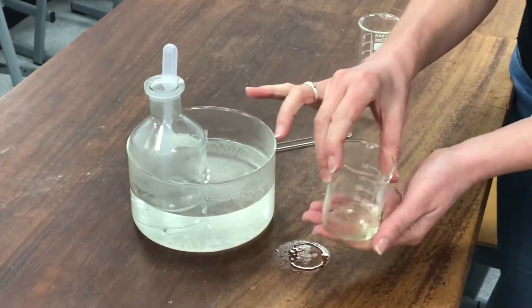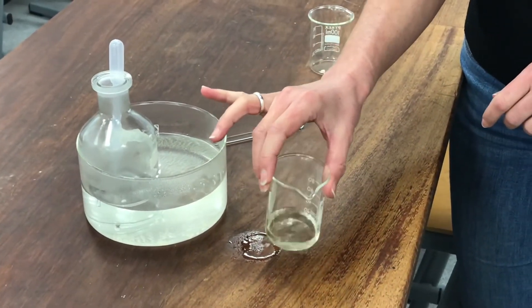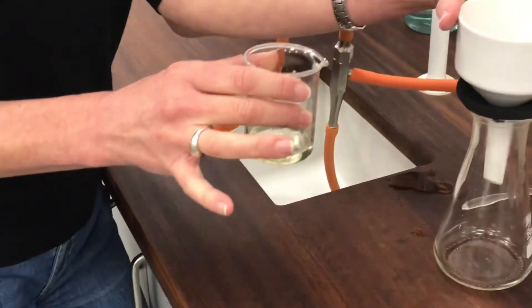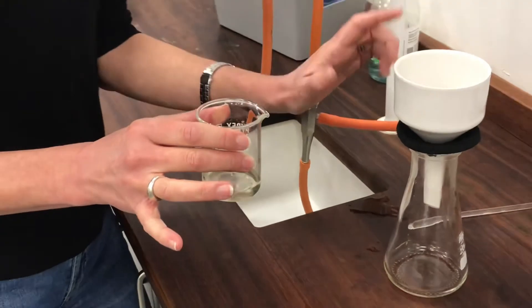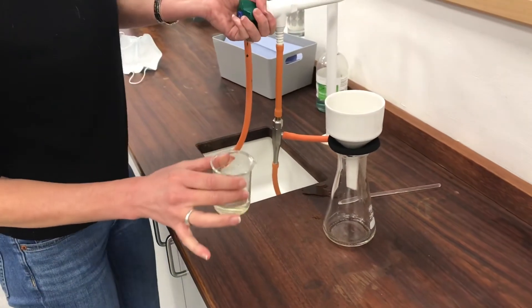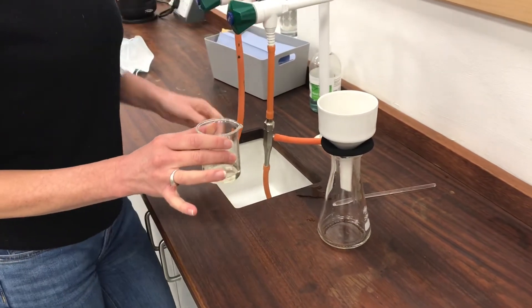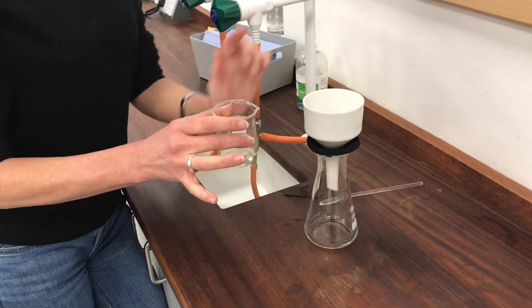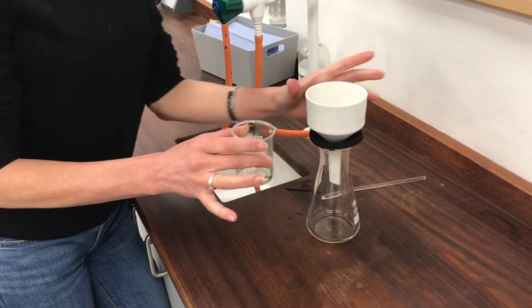So I've got that to dissolve now in this minimum amount of hot ethanol. And now what I want to do is to suction filter it through hot apparatus. So I've already poured a kettle full of hot water through this to heat it up. So I'm going to turn on my suction filter. And this time the product that I want is going to be in the bottom. It should be the filtrate.